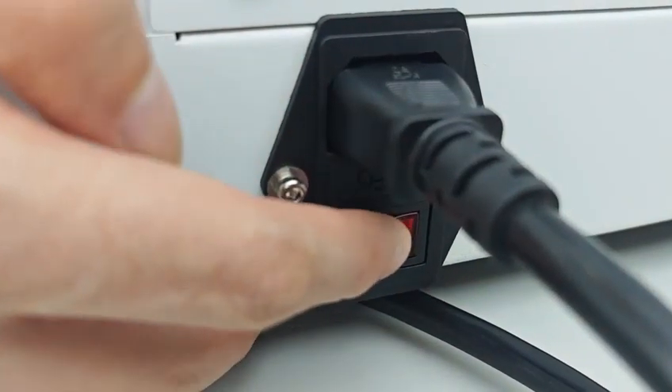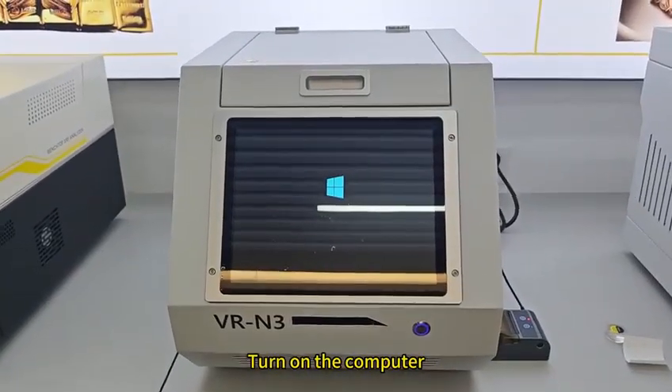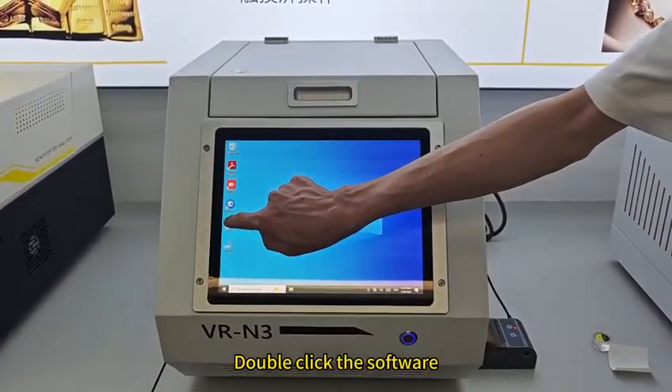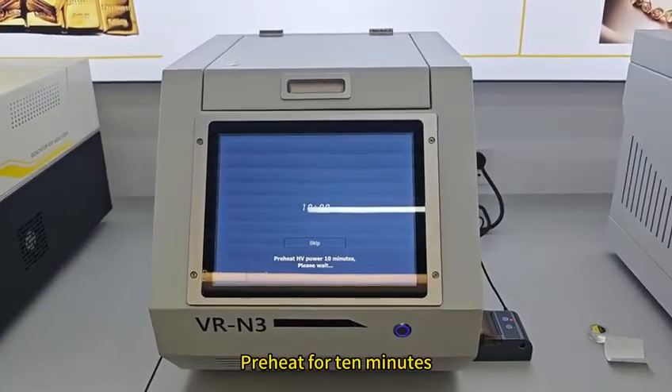Turn on the instrument. Turn on the computer. Double-click the software. Preheat for 10 minutes.